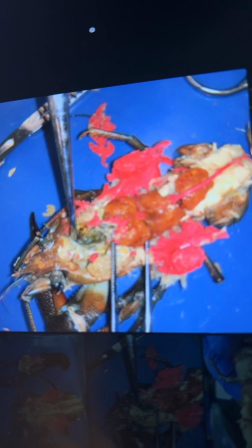So the crayfish is going to have a digestive system that starts here at the mouth. It's going to enter through the esophagus and enter a stomach part here. An interesting part is that there's actually two chambers. There's the cardiac stomach, where food is ground up with the help of the gastric mill, and then the pyloric stomach, where further digestion is going to occur. But we can actually see teeth inside the stomach here. It is then going to be digested and waste material passed out of the intestines and the anus.